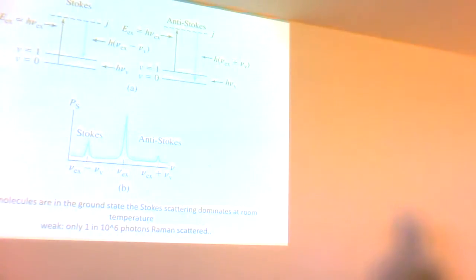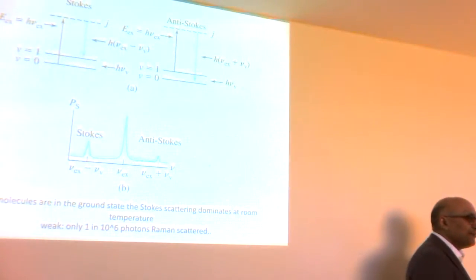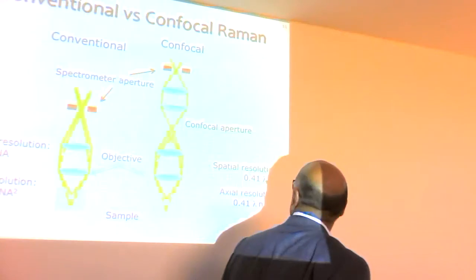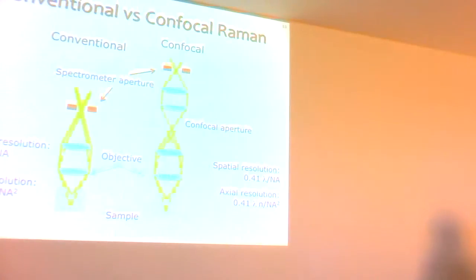which is why, and I won't have time to go into this, people are looking at enhancing Raman signals through surface enhancement and so forth, which is powerful, but also perhaps is plagued by reproducibility. People still argue today about what's the best substrate to enhance Raman signals. But Raman in its native state is still very, very popular. As Colin has already alluded to, you can do this.